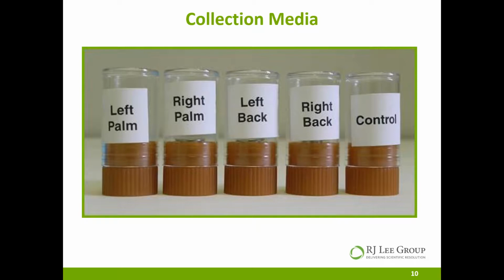So this is an excellent picture right here of the stubs that are in an RJ Lee Group kit. I want to just point out that our particular kit also has a control, and a lot of kits do have a control.